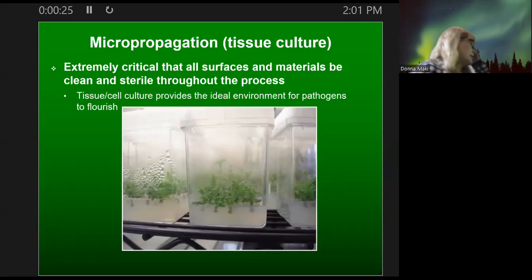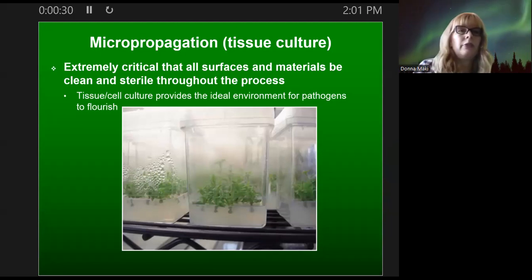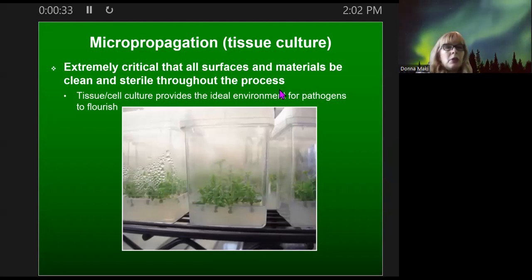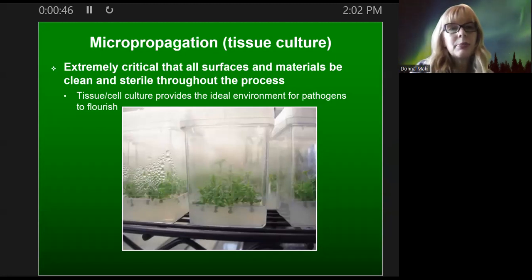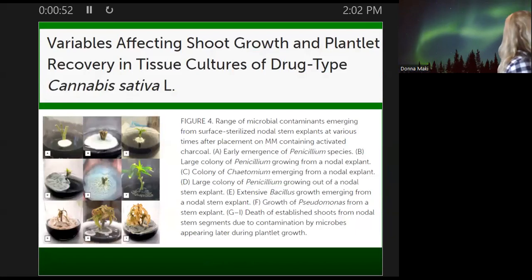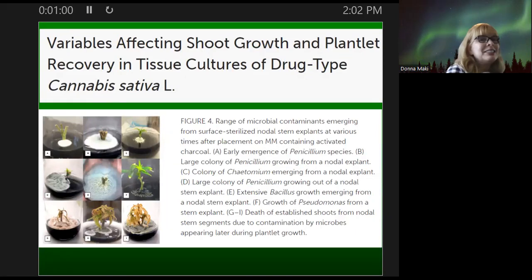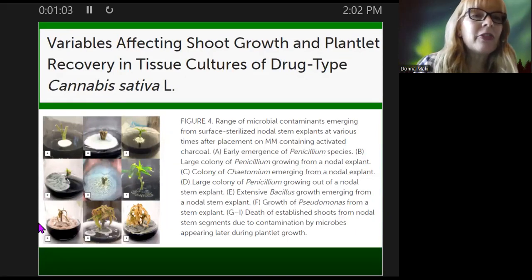There's a couple things I wanted to mention with regard to tissue culture before we jump into the last bit of this content. Talking about this idea when we were looking at it on Wednesday, that you have to have such clean and sterile conditions. You have to be so careful. I just wanted to show you some examples, because this is a common problem. This is a publication that we published in 2021 looking at doing cannabis tissue culture, and you can see as you look at the figures here.